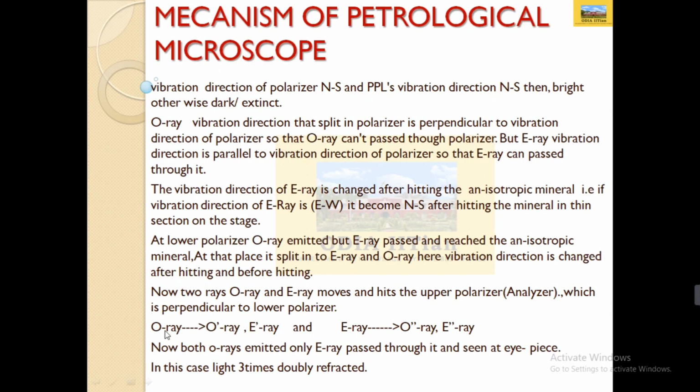Now the O ray becomes O dash and E dash, and the E ray becomes O double dash and E double dash.